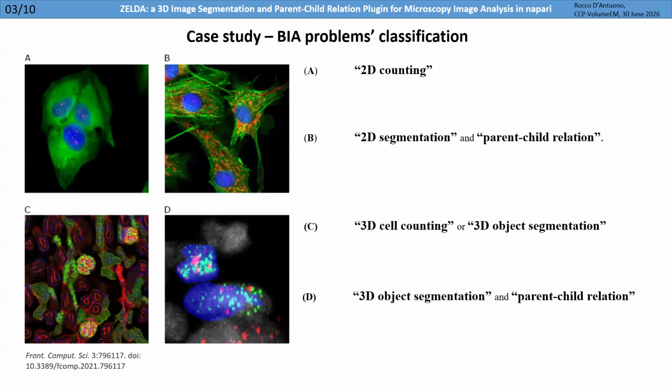So I tried to tackle common problems, like, for example, counting objects in 2D or segmenting objects in 2D and relating bigger objects to smaller objects.